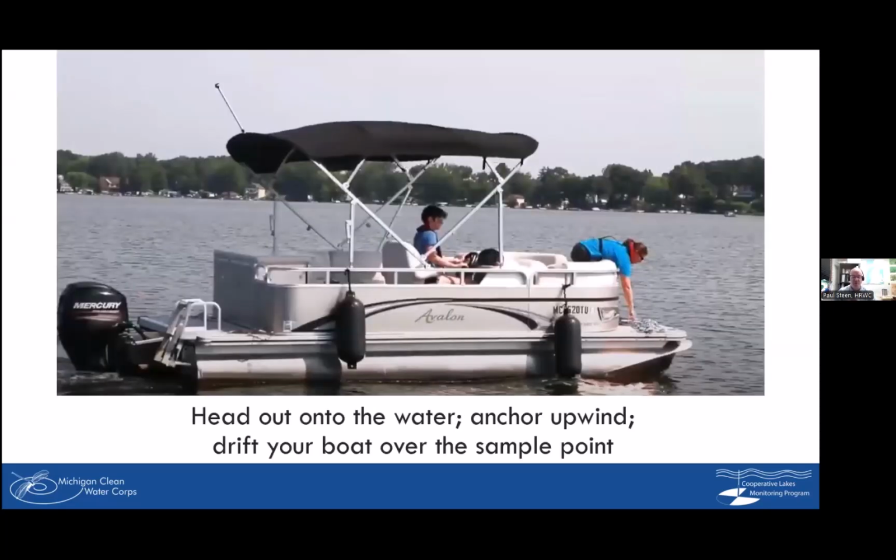So a lot like our other parameters, obviously you need to head out on your lake. It's important that you don't just throw your anchor in and cause a big plume of sediment that you have to sample into. So it's a better practice, if there's no wind, to just cut the motor and drift over that sample point. And if it's windy and you have to anchor, it's better to anchor upwind and let the wind then push you into that sample point. So ultimately what you're trying to do is keep the water as still as possible.